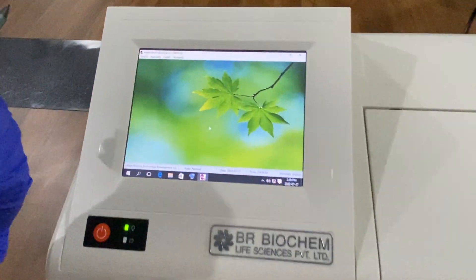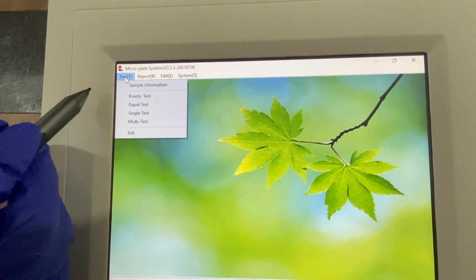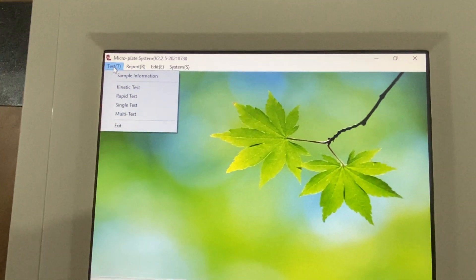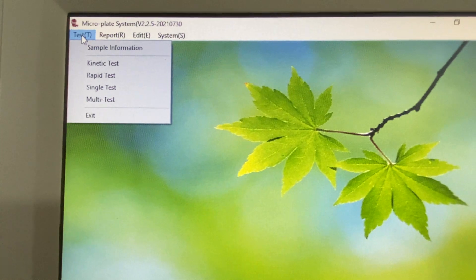In this ELISA reader, there are options for different types of tests. You can perform a kinetic test, rapid test, single test, and multi test.